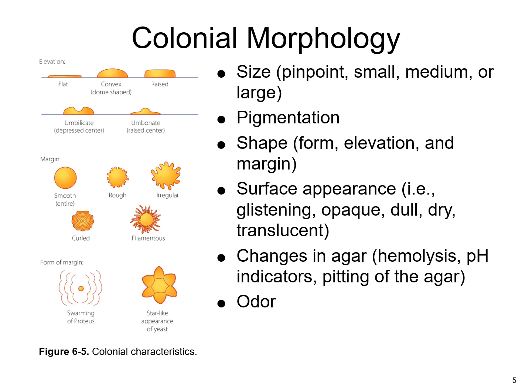How does the surface of that colony look? Does it glisten? Is it transparent, translucent? Is it dry? Is it dull? Is it opaque, meaning it actually does have a color that you cannot see through? Does it look wet? Does it look mucoid?